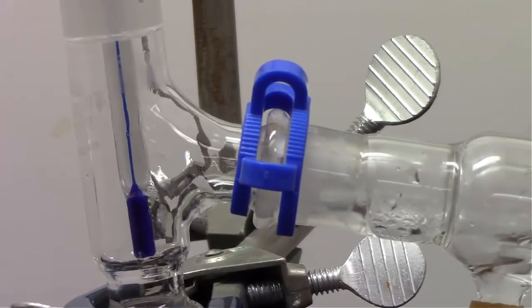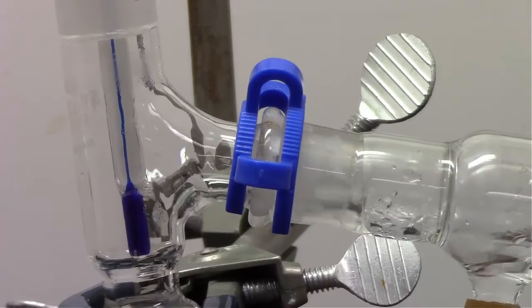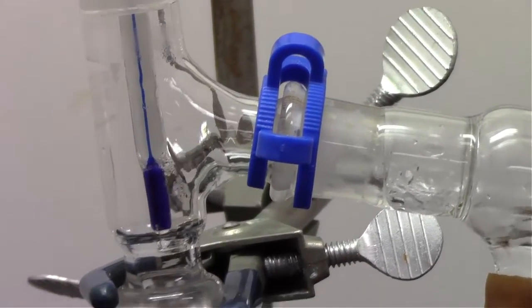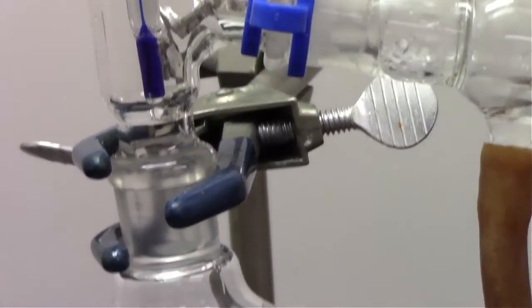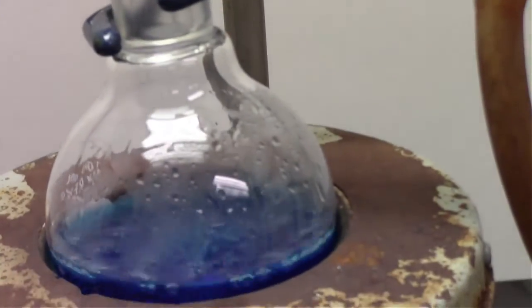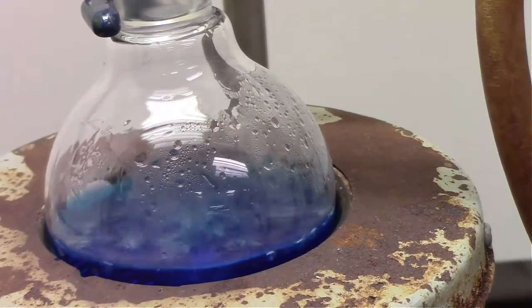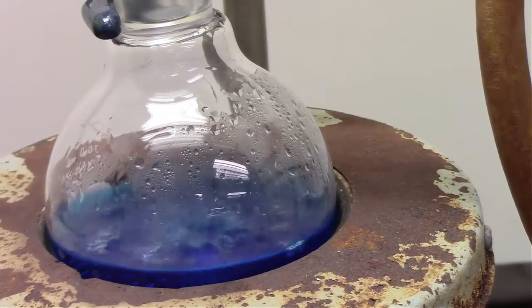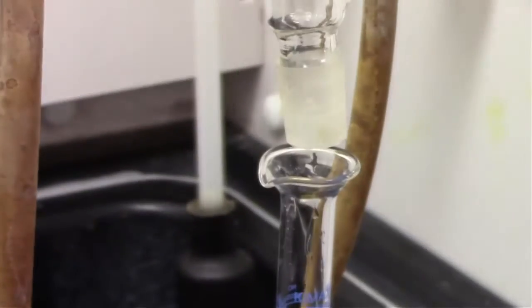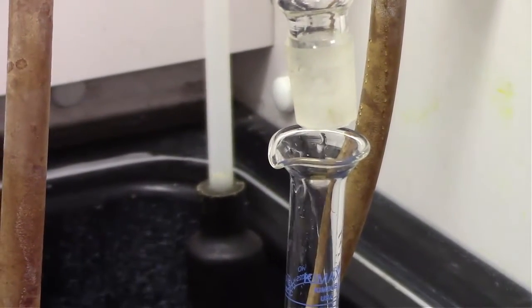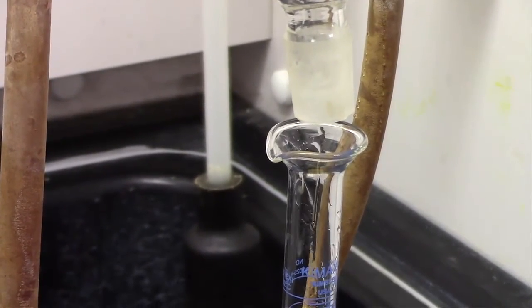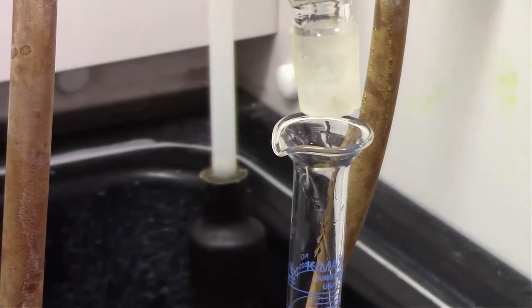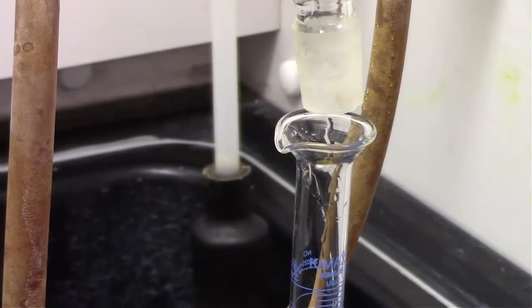If you haven't already, I recommend take a break and see what the boiling point of acetone is. That is the expected temperature at which acetone will be collected. So all of the evaporation and condensation happening, for that to happen, we need to reach the boiling point of acetone before it can actually evaporate to the point where it can condense by where the condenser is.